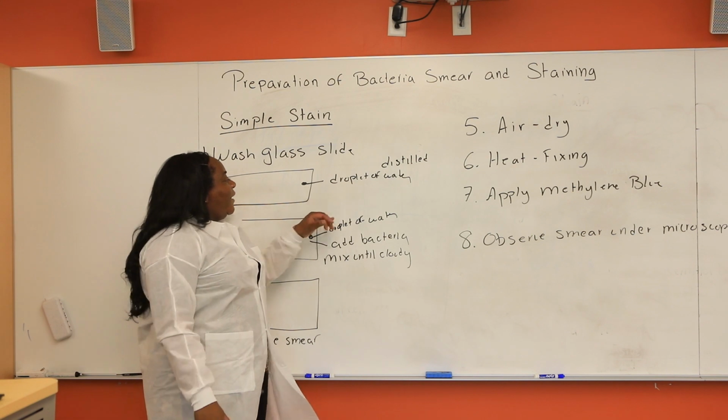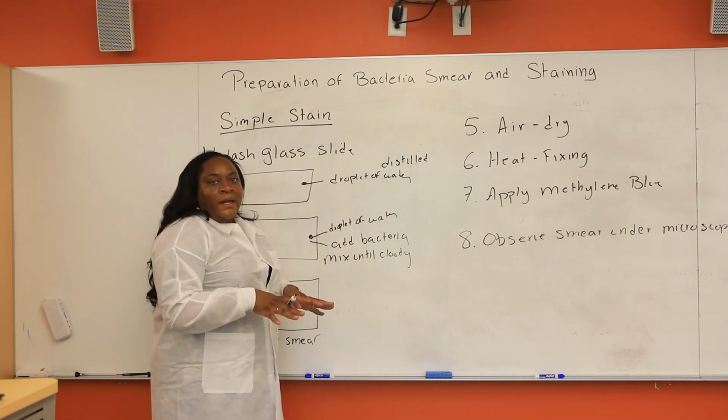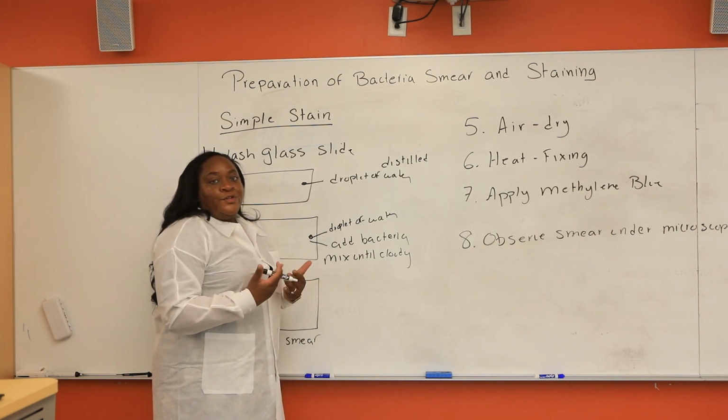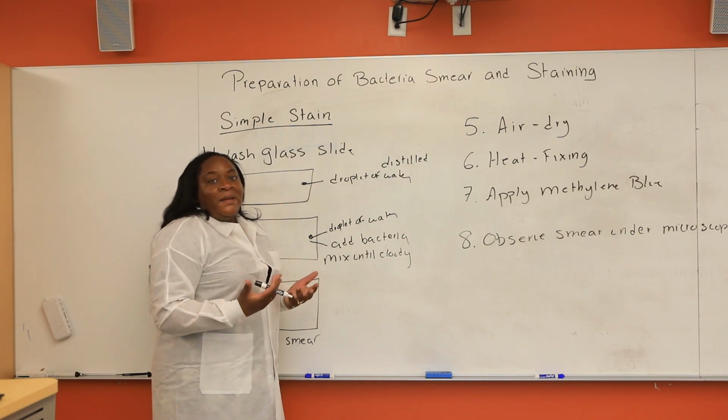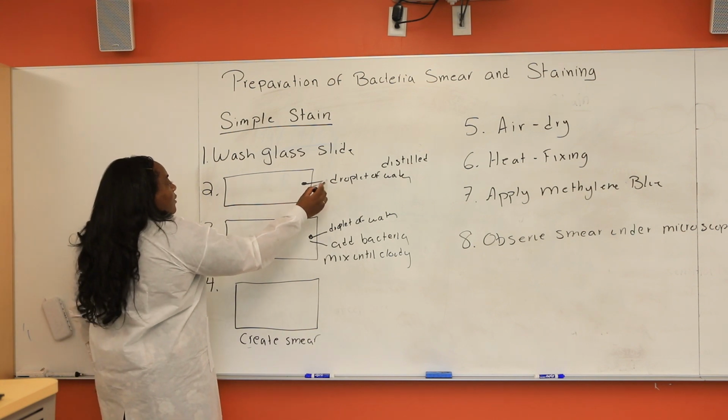And the reason why we are adding water is because we're taking bacteria that has been grown on a solid media, and that was agar. If we were taking the bacteria from nutrient broth, let's say, a liquid media, we would not have to introduce water, okay? So here is our droplet of water.